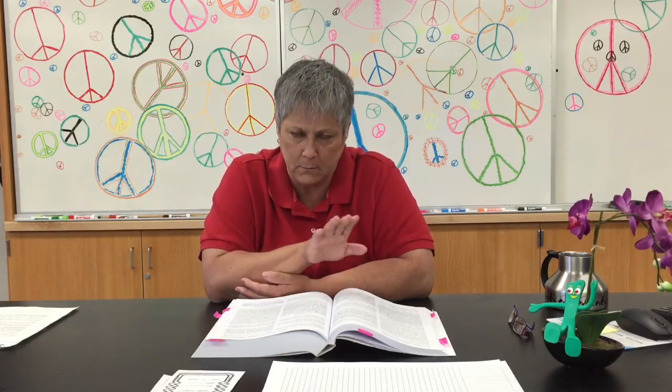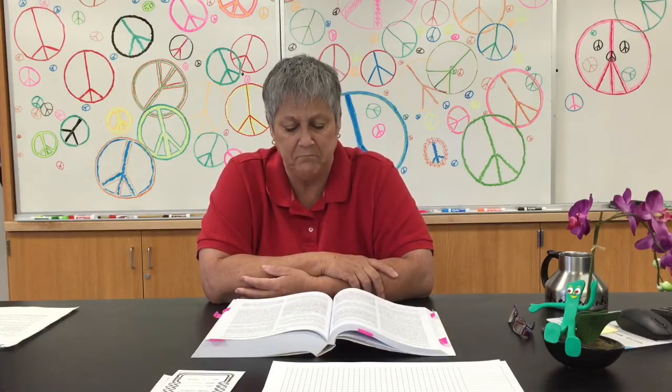There is way more info in Bergey's manual than I think any human actually needs, but I'm looking mostly at the bold-faced information, and it says, let's see, facultatively anaerobic, form capsules, don't use that one. Oxidase negative, I can use that. Catalase positive, I can use that. Decarboxylation of arginine negative. All right, so there's several little bits of information there that are useful to me.